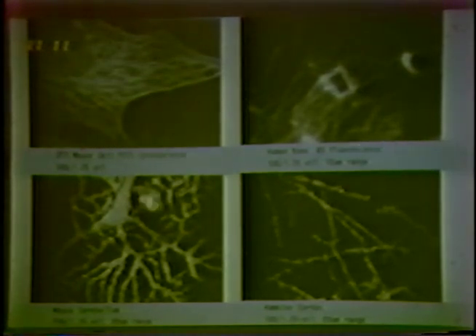And it's labeled what they are underneath. Where I've put that the image is a range image, it indicates that we've not only taken the one focal level, but during the time that we record the image, we've actually changed the focus to add together the information from several different focal levels.